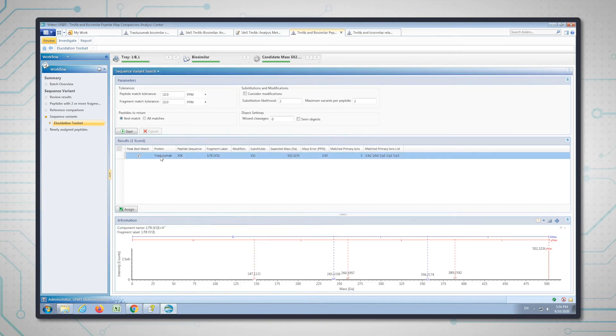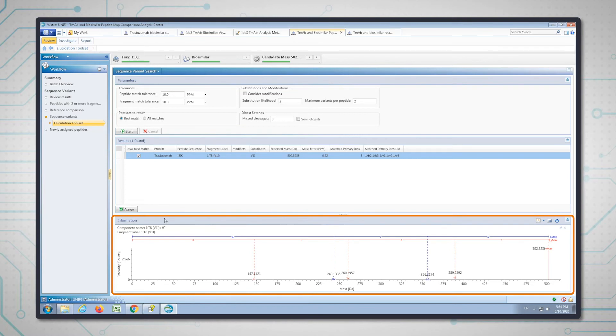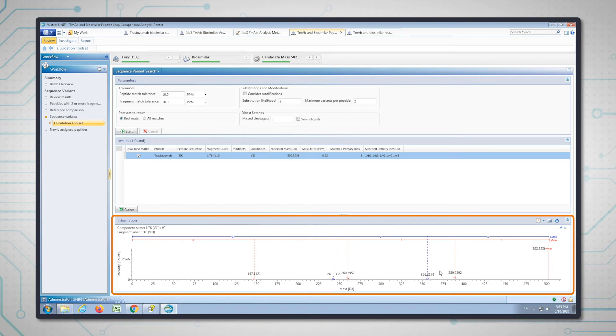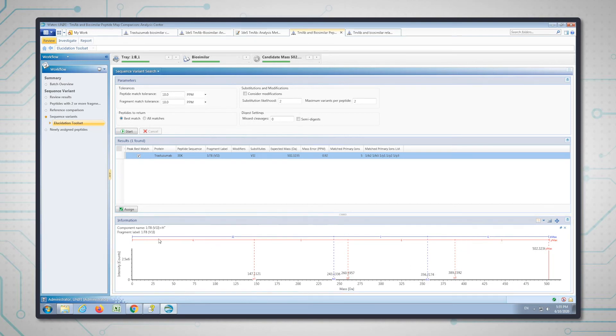If I click on this, you can see that on tryptic peptide eight of the light chain, which is what the one means here, we have a valine to isoleucine substitution. We have some B and Y ions there to give this confidence. If I'm happy with that, I'm going to assign it.